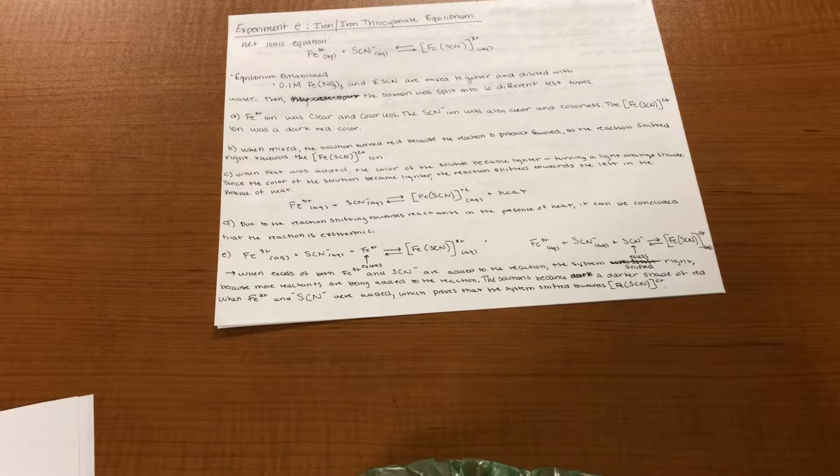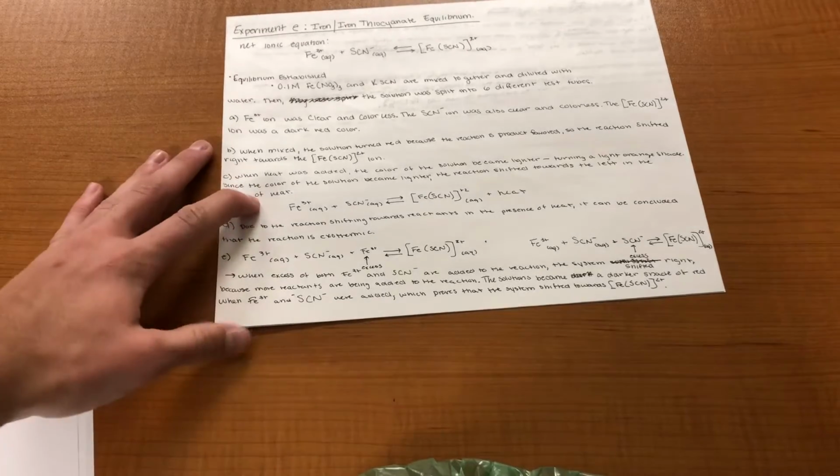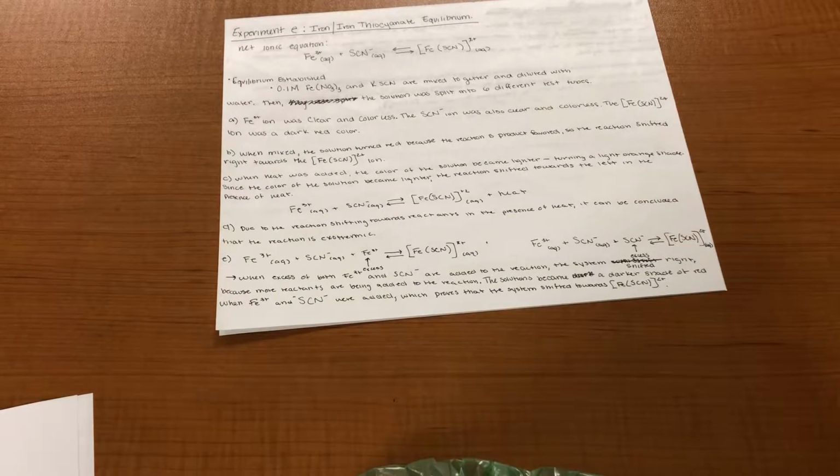When heat was added, the color of the solution became lighter, turning a light orange shade. Since the color of the solution became lighter, the reaction shifted towards the left in the presence of heat. Due to the reaction shifting towards reactants in the presence of heat, it can be concluded that the reaction is exothermic. The reaction including heat is shown here. Heat was added to the right or the product side of the equation, therefore it is evident to say that it is an exothermic reaction.